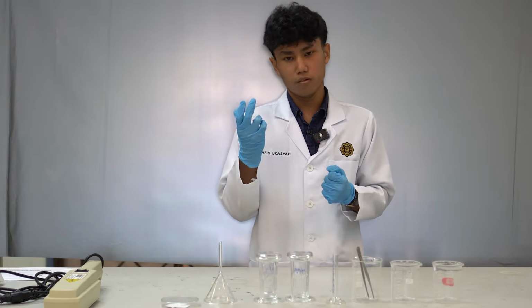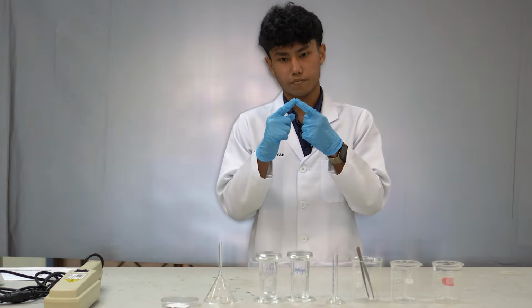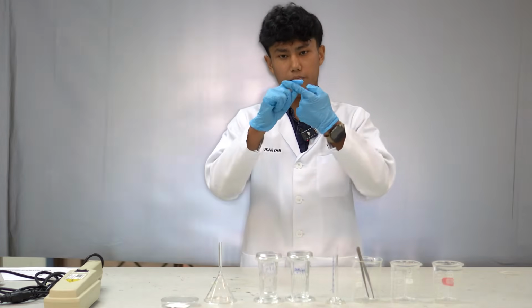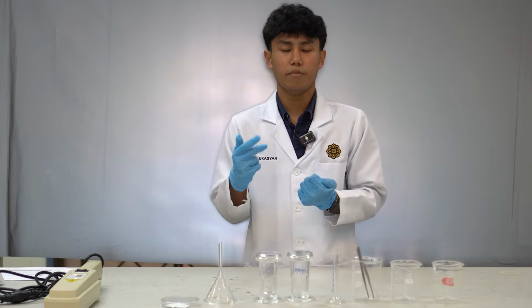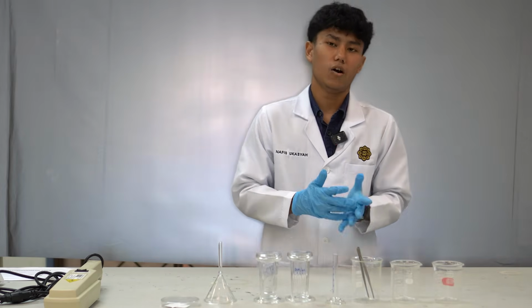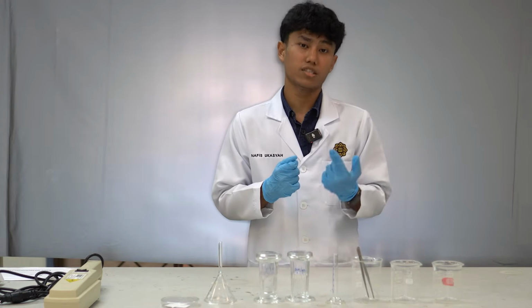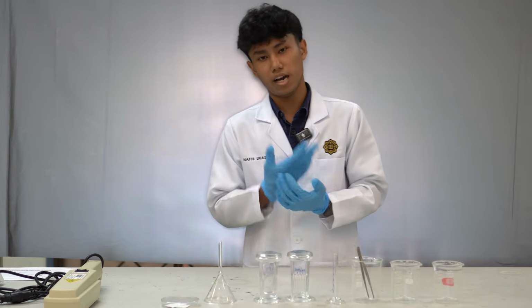We view the sample through the transparent plate, so it can prevent danger, because it can cause cancer when you are exposed to UV light for a long time. UV light can also destroy our cornea, so it can irritate our eyes and cause pain.